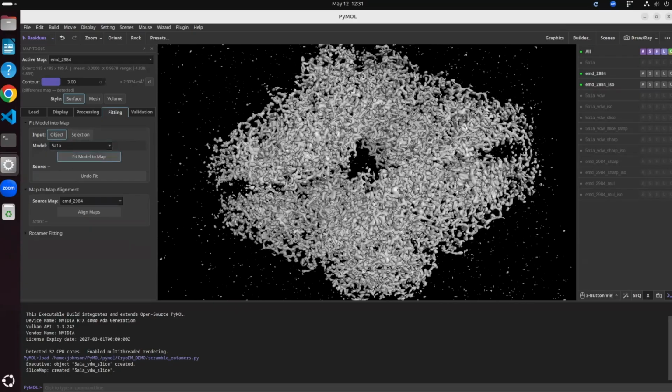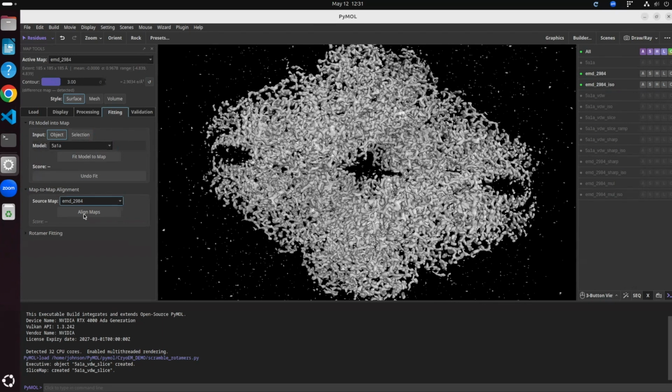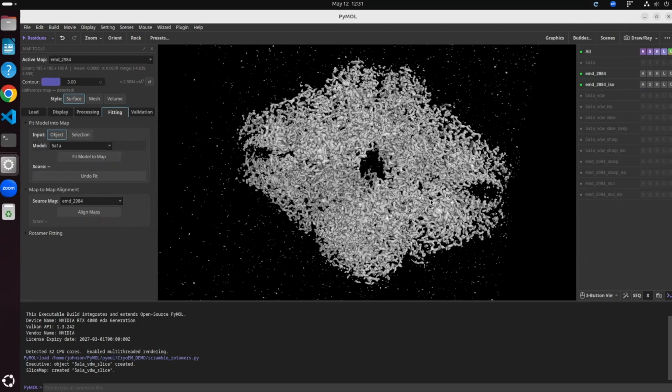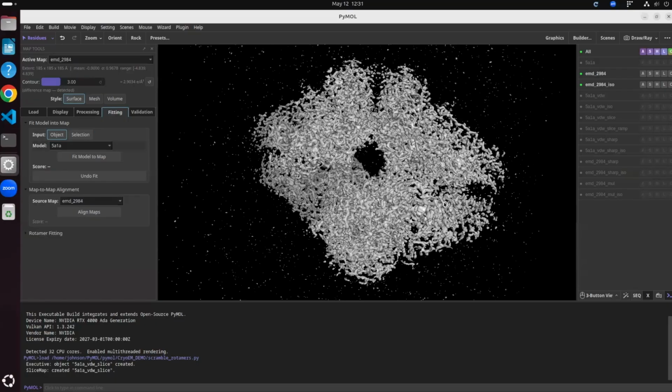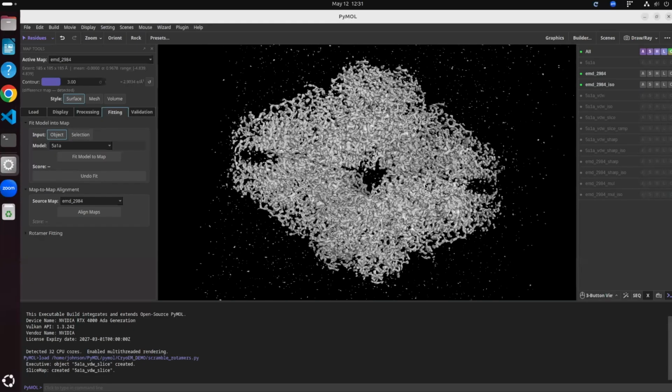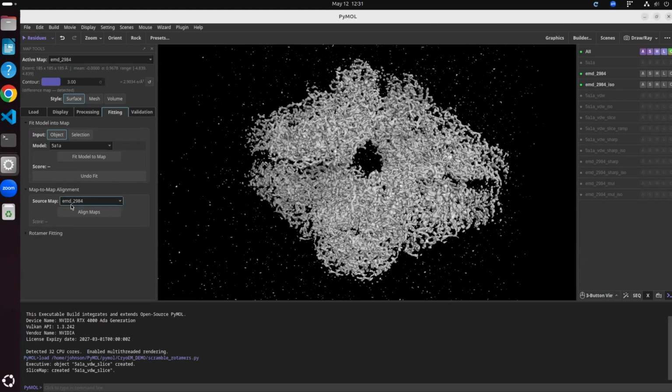And yeah, I probably won't do it here because depending on the resolution of the map, this could take a pretty long time. But PyMOL will show the top 10 ranking poses that you can just click through to see which model you believe probably fits best. And you could take those and refine it further, which we're planning on possibly supporting in some form or reaching out to additional tools like Schrödinger core suite tools to perform.